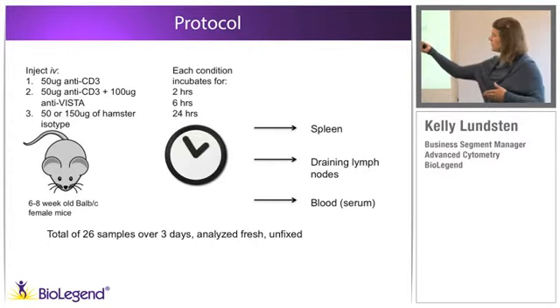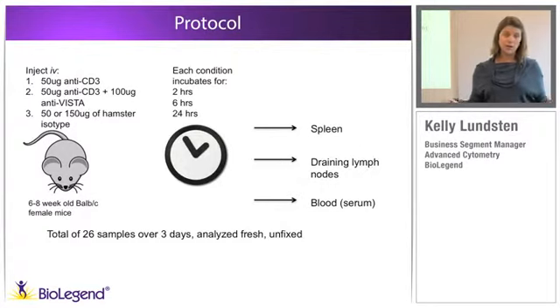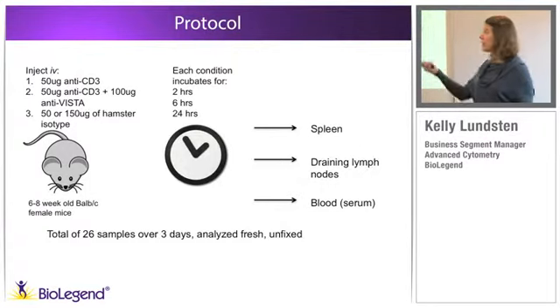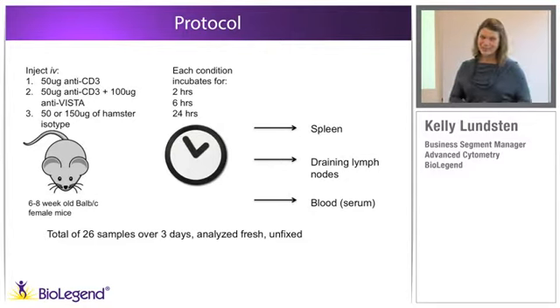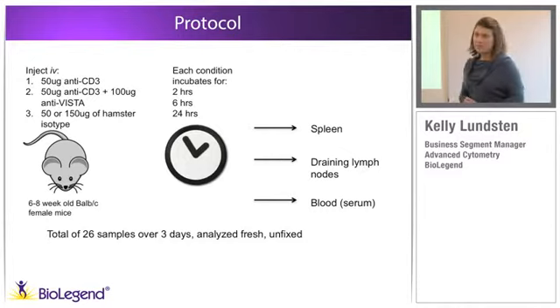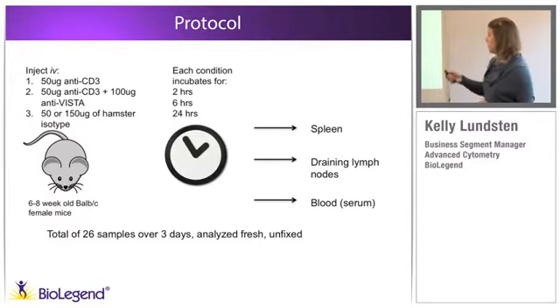The VISTA, we weren't exactly sure. We did a lot of preliminary work to determine how much CD3 to inject, and that was relatively well described in the literature as well. I could have probably even gone down to 25 micrograms. We didn't have to necessarily do 50. But the VISTA application, on the other hand, was extremely not well described in the literature. It was a lot of guesswork. So we went with a potentially pretty high concentration of the VISTA just to ensure that we were getting sufficient coverage. So we used 100 micrograms of the VISTA.